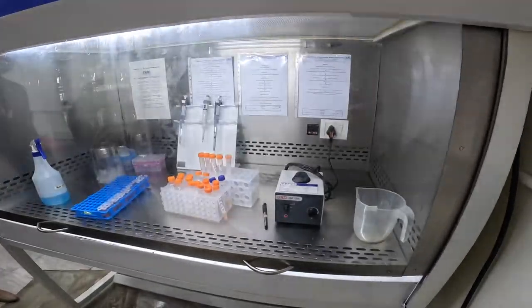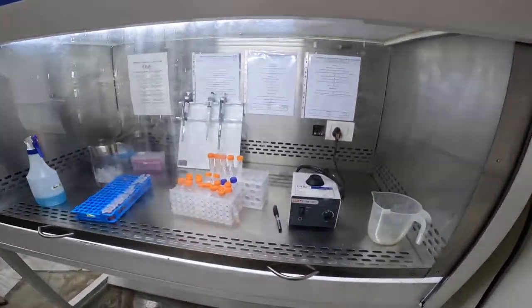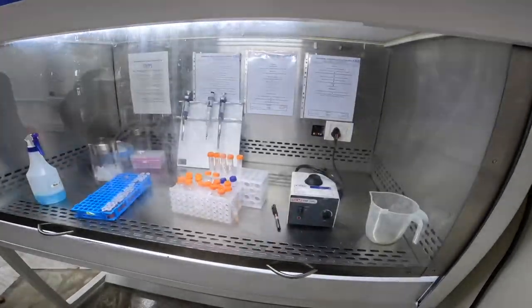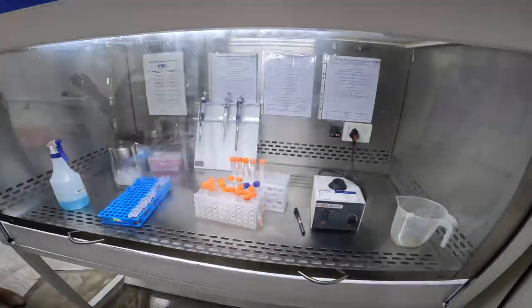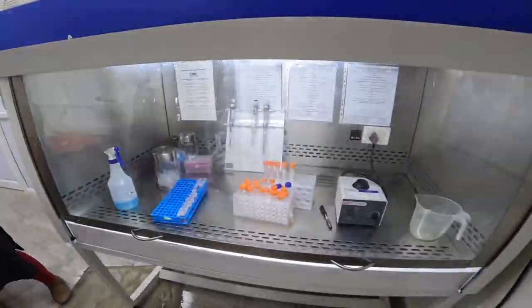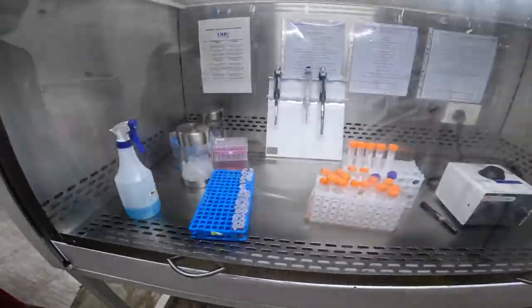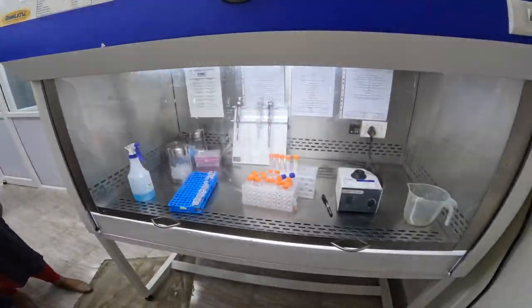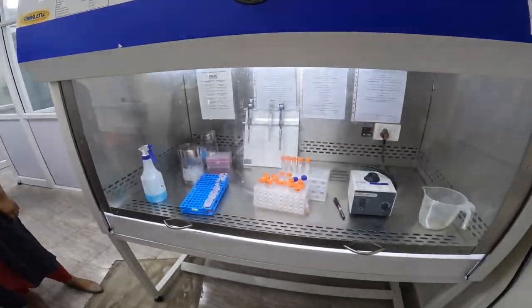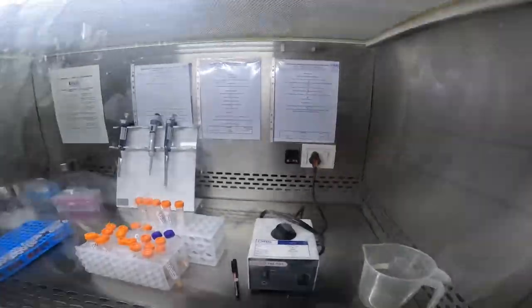This is the machine where we do the RNA extraction. First, after taking the sample, it comes into this room, and all the samples are aliquoted and stored at minus 80 degrees. This laboratory has three rooms for preparing the RT-PCR before it goes into the main RT-PCR machine. So this is stage one, preparing the aliquots of the samples received.